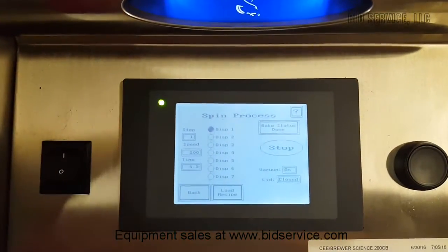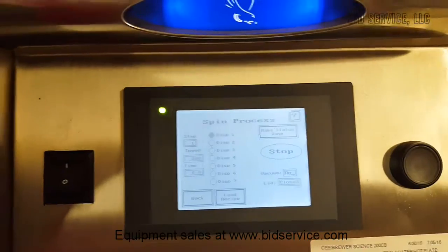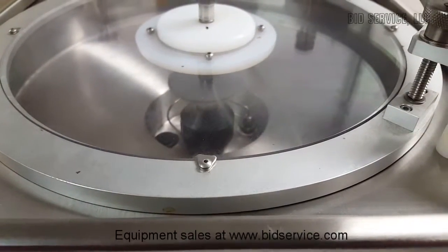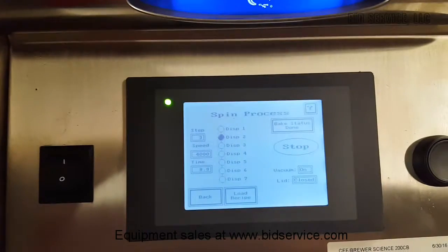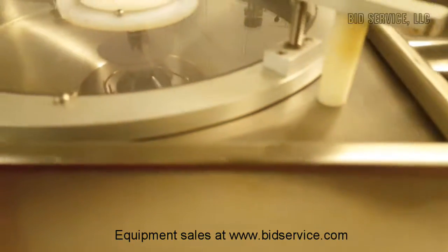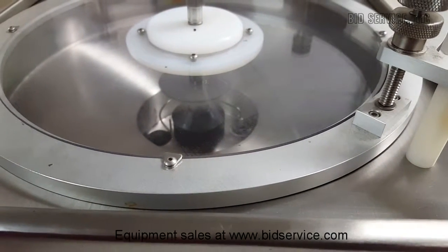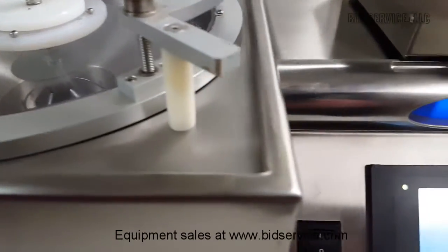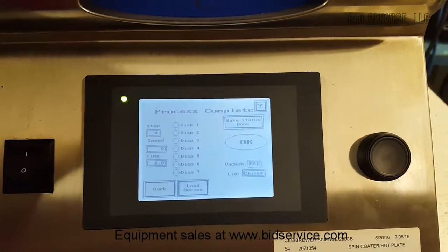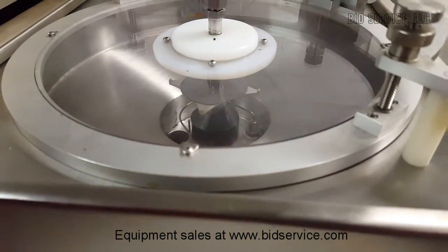Here's the indicator that tells you I'm running at 200 RPMs, and you can see that it's spinning up. Look at the chuck now — it's actually at the second step at 1,000 RPMs. The next 10 seconds it's going to change and go up to 4,000 RPMs, which you can pretty much hear. And another 10 seconds it's going to run at 5,000 RPMs, which it's jumped to right now. And then it's going to shut off — and it stops. You can see the chuck up here is stopped, and that little beep is the end of the process.